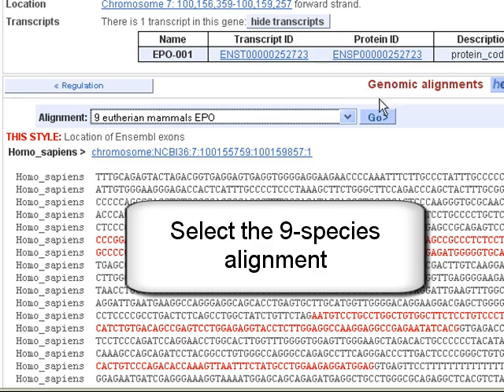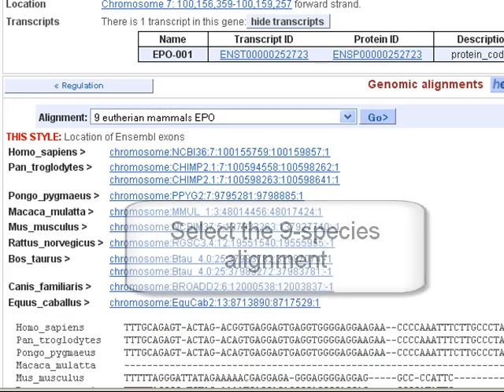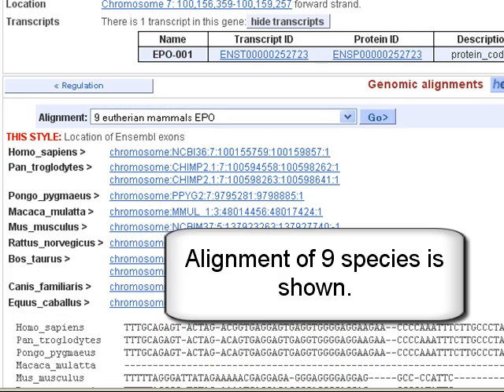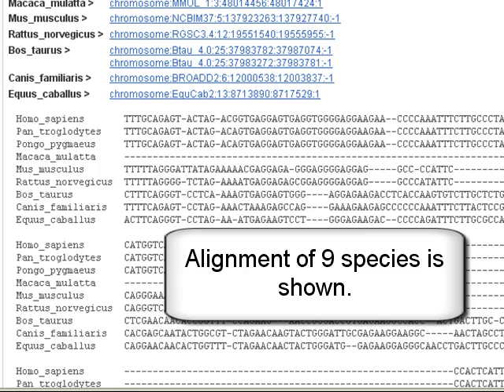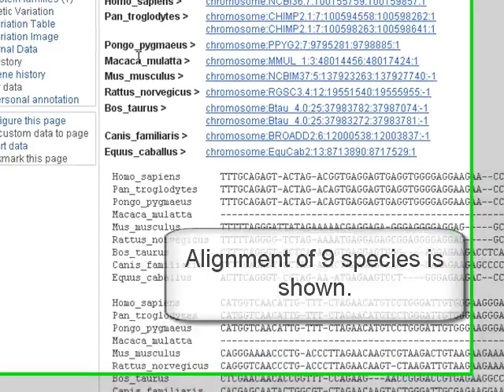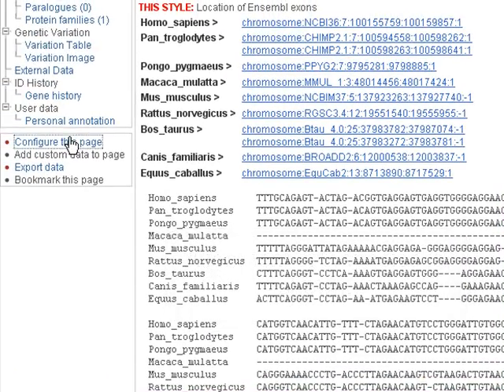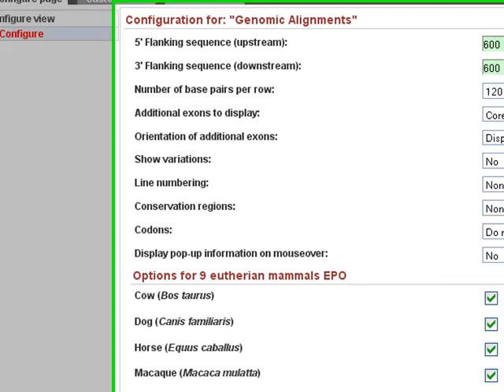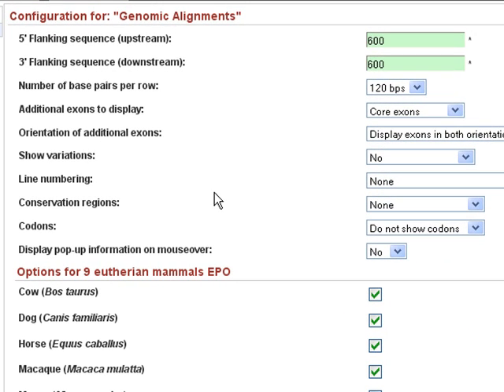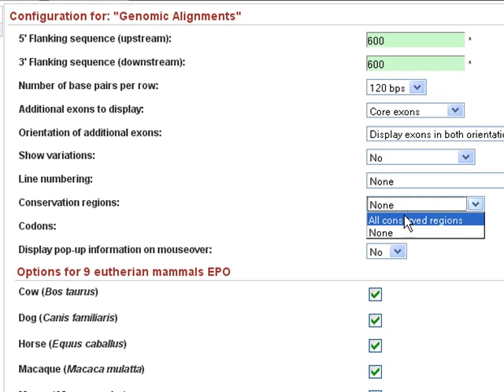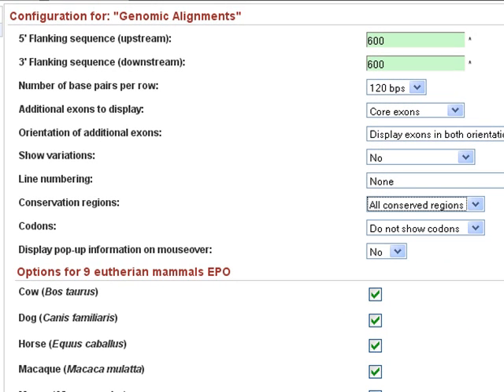Click go. This is the alignments. However, to show conserved residues, I have to turn them on in configure this page. You can choose conservation regions, all conserved regions, then save and close.